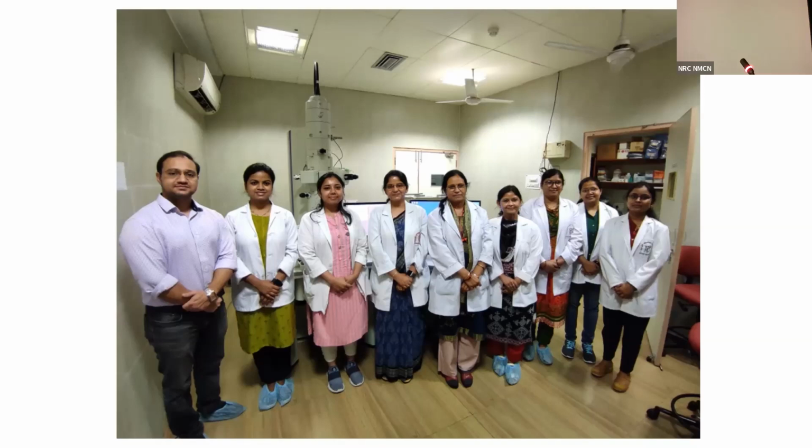Then you go into high power and look at each organelle separately. Of course, you have to take into account that everything from start to end has to be very perfect. Otherwise, you will not be able to see those double membranes. Apart from that, processing is almost finished, except when you are doing immunology.